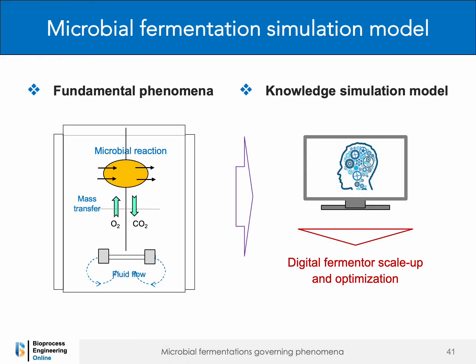The fundamental phenomena of microbial reaction, mass transfer, and fluid flow provide the basis for knowledge-driven simulation models in bioprocess engineering. Such models allow the prediction of dynamic variations in nutrients, cells, and metabolites across different bioreactor operating modes. They are powerful tools that support the digital scale-up, control, and optimization of microbial fermentation processes. The development and application of fermentation simulation models will be explored in greater detail in an upcoming tutorial.